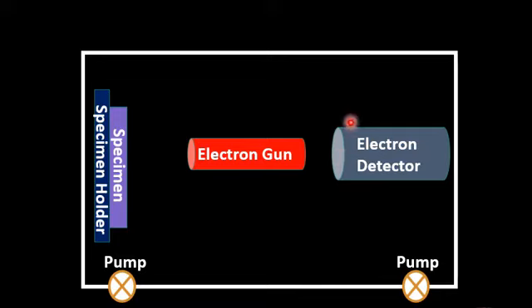So dear student, the electron energy analyzers are usually based on the cylindrical mirror analyzer, and that detector has proven to have a higher efficiency and good energy resolution. So in the Auger electron spectroscope, the electron detectors are usually cylindrical in shape. They are cylindrical mirror analyzers with higher efficiency, because efficiency is very important in Auger electron spectroscopy.